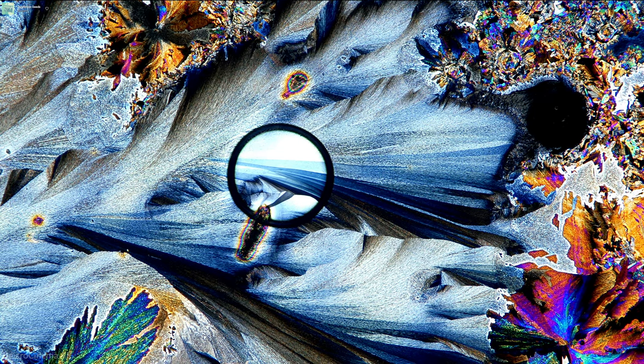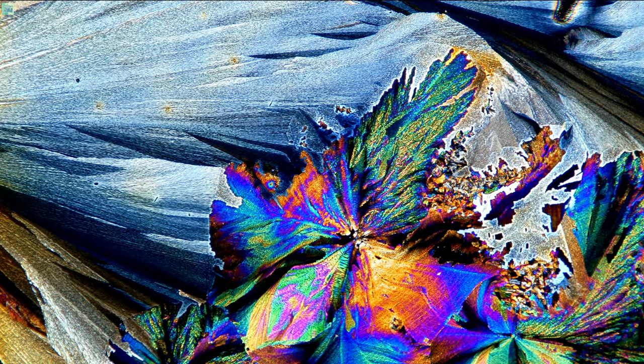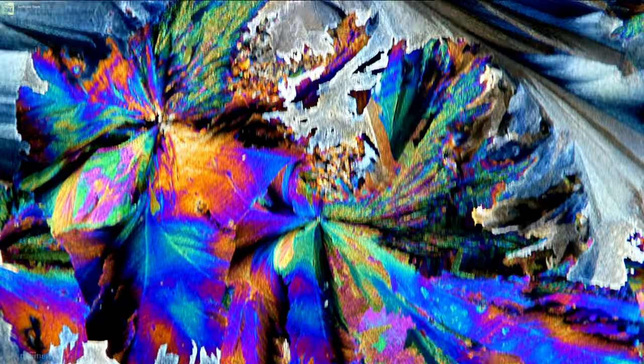Whoa, that's weird. Under this bubble here, those little variations go away. Huh. This is acetaminophen.